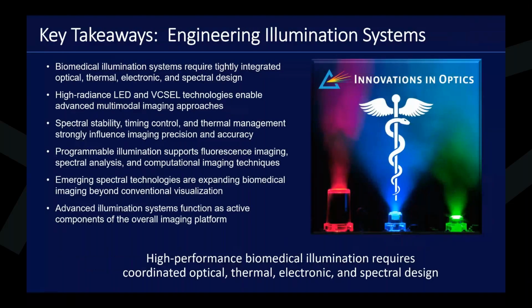As biomedical imaging systems evolve toward more spectrally selective, multimodal, and analytic imaging approaches, illumination systems are playing an important role in overall imaging performance. Throughout this webinar, we looked at how optical coupling, radiance, spectral control, thermal management, electronic drive architecture, and wavelength programmability interact with modern biomedical illumination systems.